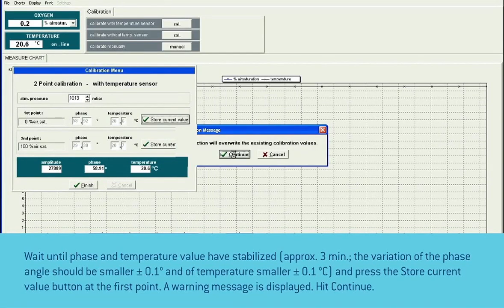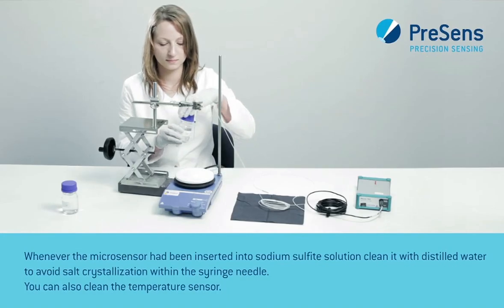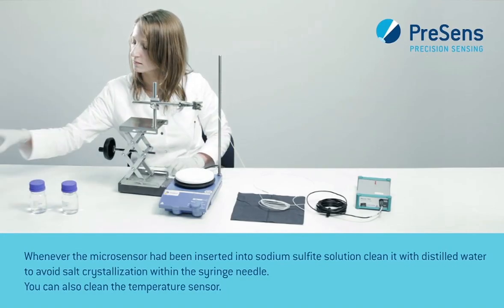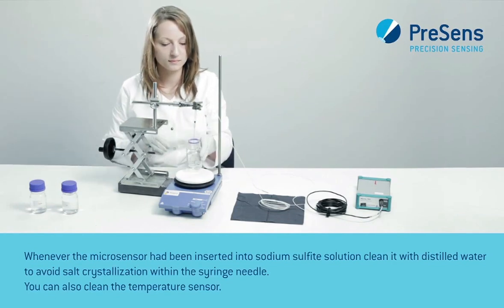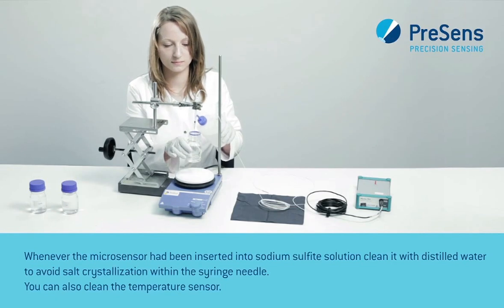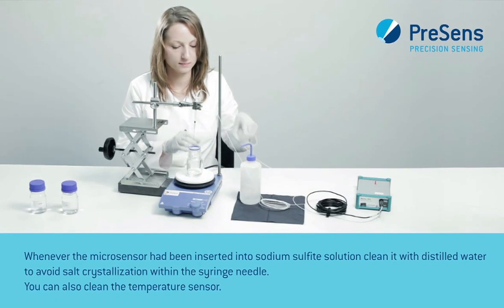A warning message is displayed — hit continue. Whenever the microsensor has been inserted into sodium sulfite solution, clean it with distilled water to avoid salt crystallization within the syringe needle. You can also clean the temperature sensor.